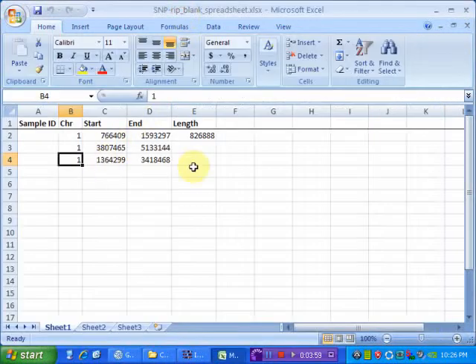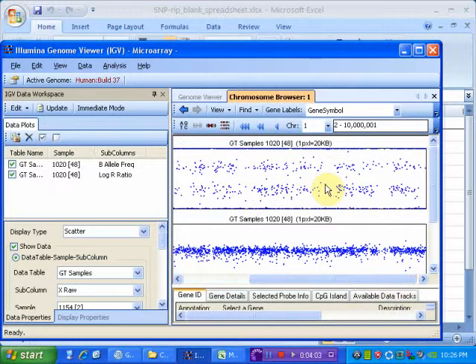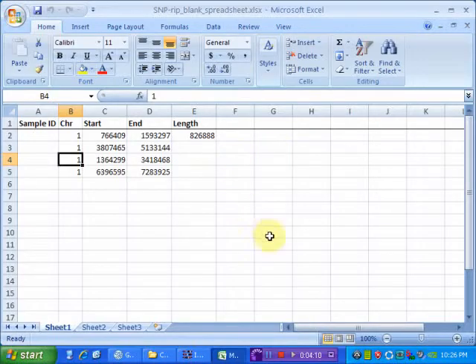And what it's doing is populating the values here. As you go along, there's one of interest: F1, F2, F1, F2, and so forth.